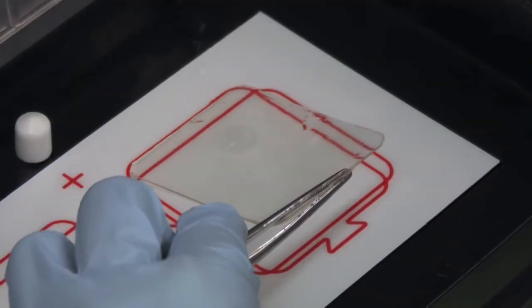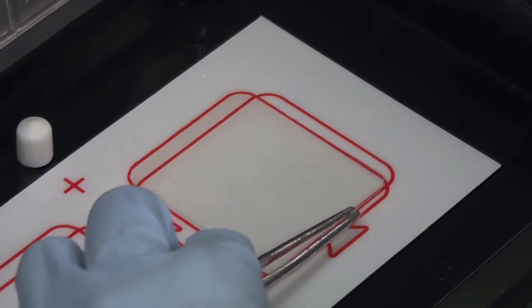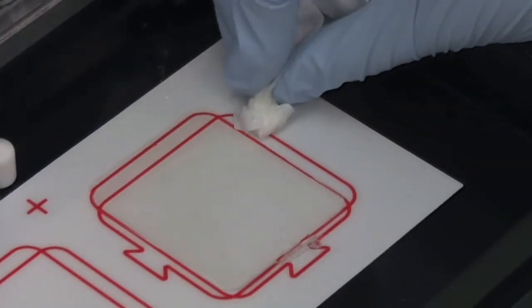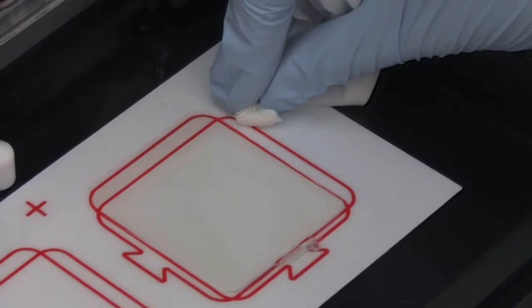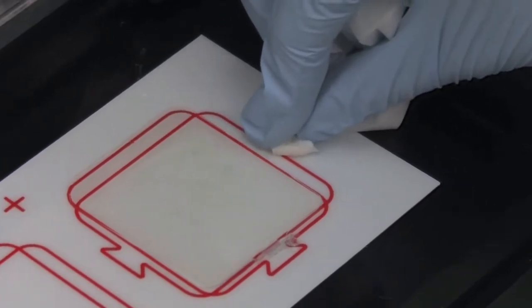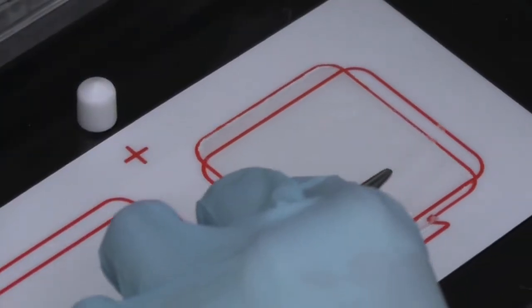Put the gel on the bed and ensure that no air bubbles are trapped. Remove excess dd water by touching the edge with Kim wipes. Remove the top plastic cover off the gel.